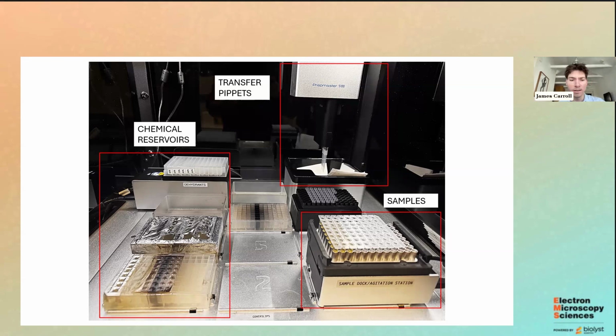Our next question is, could you elaborate more on how cultured cell pellets are processed? We receive material from other labs that is already grown on cover slips.